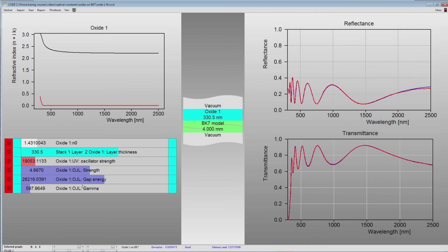Okay, as a follow-up of this tutorial, I will generate one where we repeat some of these steps, but in a limited spectral range, so that we can analyze a lot of input spectra that have been measured in the factory, basically analyzing a series of spectra obtained by a traverse system in a large area coater.